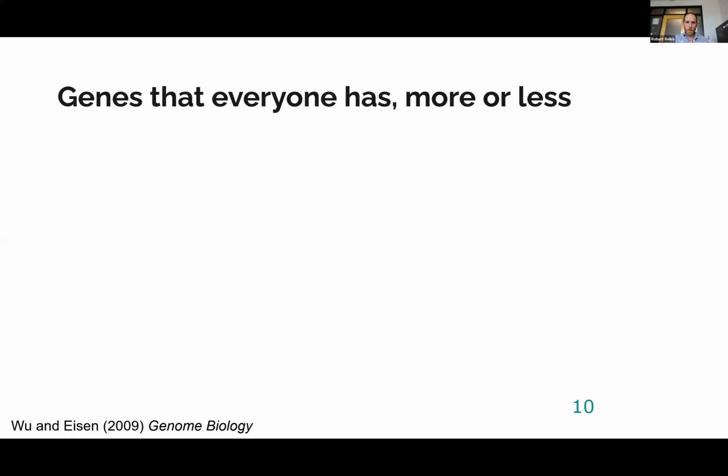All right, so let's say we want a short sequence that we can use to profile everything, right? All of the microbial biodiversity in our sample. Well, it stands to reason that perhaps the best way to do this is to identify something like a gene, some kind of stretch of nucleotide sequence that everyone has, more or less. And so people at various times have tried to profile the core set of genes in bacteria and archaea. Many different studies have done this, with different ways of defining the core.